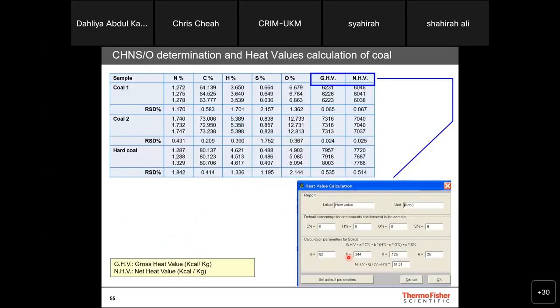Based on this, they will determine whether their product is in good production order. QAQC will always need to determine this and make sure that their product is always within the acceptable range. If something goes wrong or they observe a certain anomaly, they immediately give feedback to manufacturing. So this is how the QAQC lab serves as a final product check and informs their manufacturing counterparts.